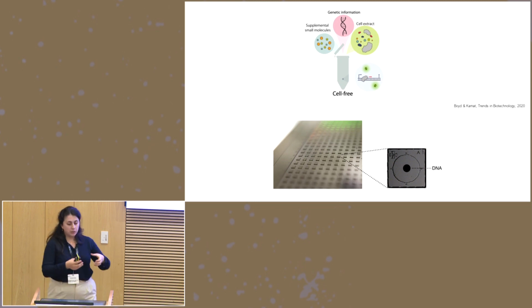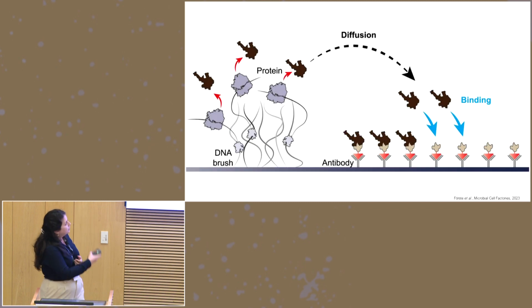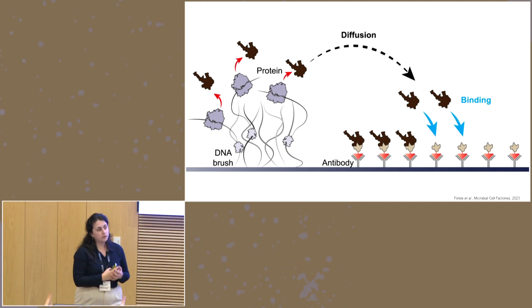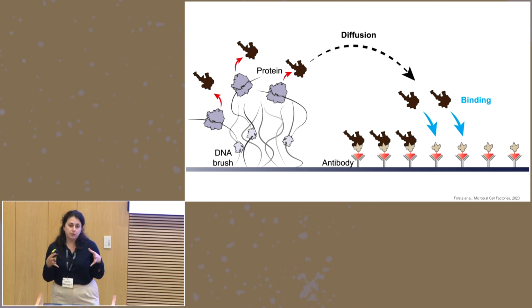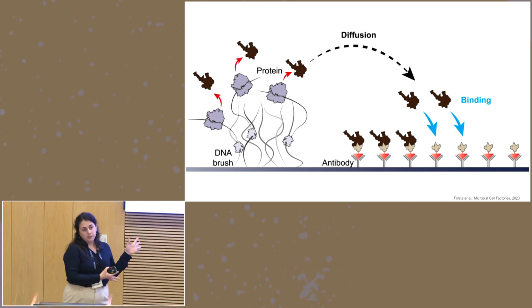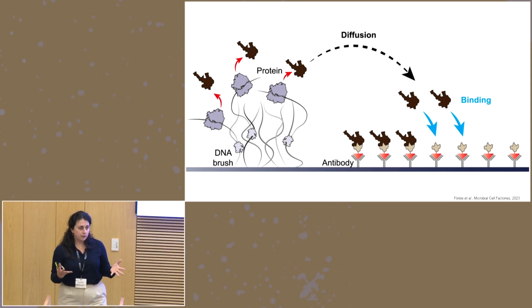We take those silicon chips and we carve out little compartments that are about 100 micron in diameter. In there we deposit our synthetic DNA. And when we incubate it with cell lysate, we express proteins that then bind on the surface around the DNA. So what we have here is an artificial cell with a kind of localized genotype-phenotype linkage. This method has been used to build complex molecular machinery, to do dynamic circuits.